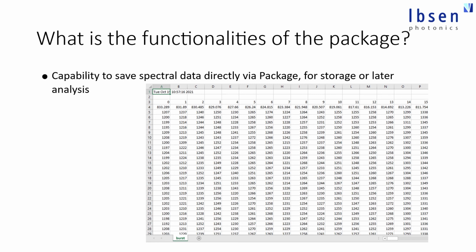Of course they can't all be displayed, but this makes it very easy and convenient to work with, in the sense that you can look at the data later at some point and analyze it in another program, or just via Excel, or just for saving data for later storage, whatever might be needed for your application.